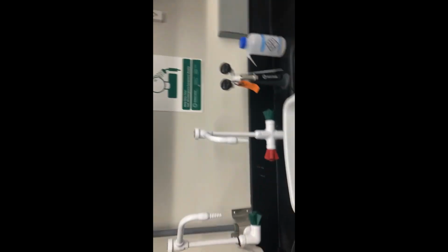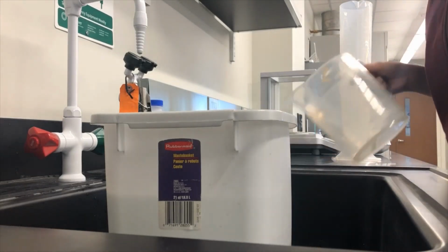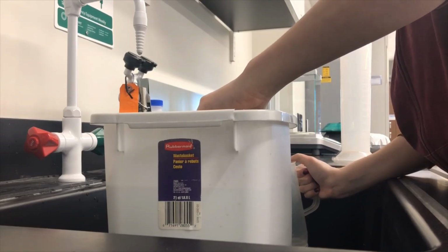But let's just set. Okay, so I am now immersing the balloon, immersing.